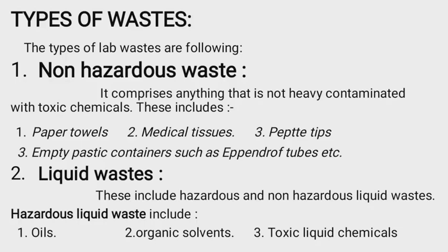First is non-hazardous waste. It comprises anything that is not heavily contaminated with toxic chemicals, such as paper towels, medical tissues, pipette tips, and empty plastic containers such as tubes, etc. And the second type is liquid waste. This includes hazardous and non-hazardous liquid waste.